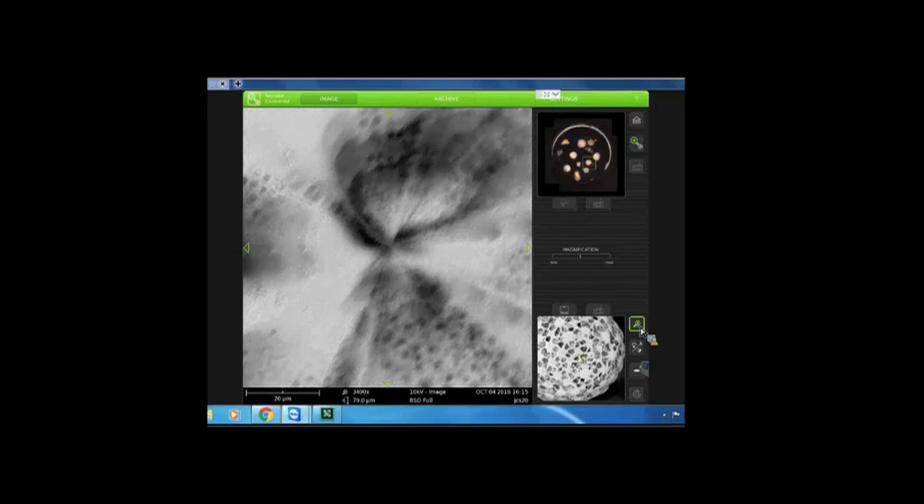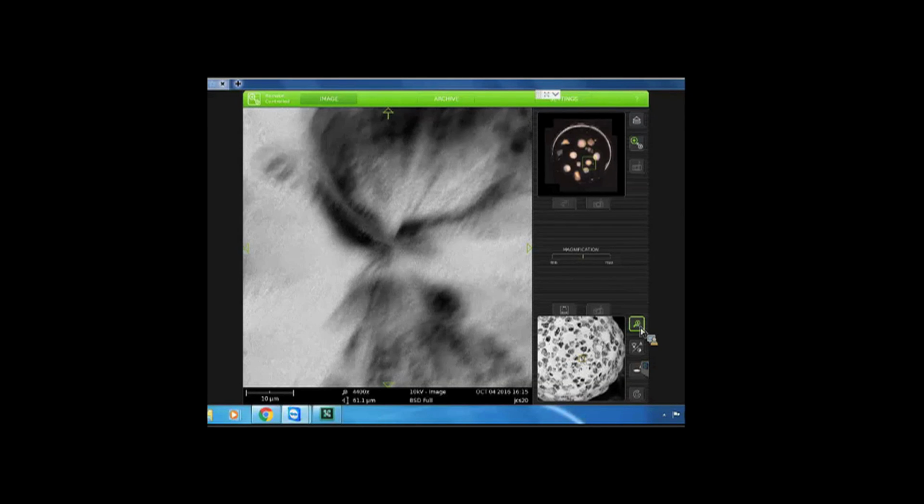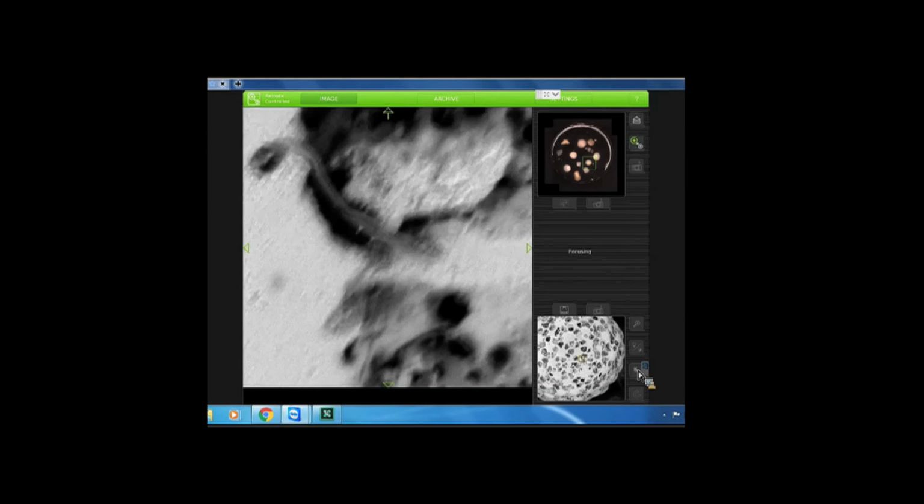One thing you do have to be a little bit careful of with a big sample is that if you get too close, you lose a lot of the image in the sample. So let's go back down and focus it again. Move the cursor down to the oval. We're going to focus it. We'll do an autofocus again. Sometimes if we get too close, we have to focus it manually, and it ends up taking more time. So for remote access, you can then do the brightness and contrast right above it. That's better.